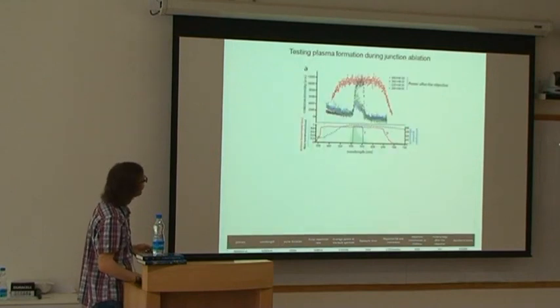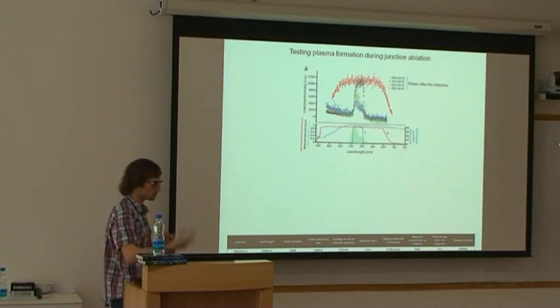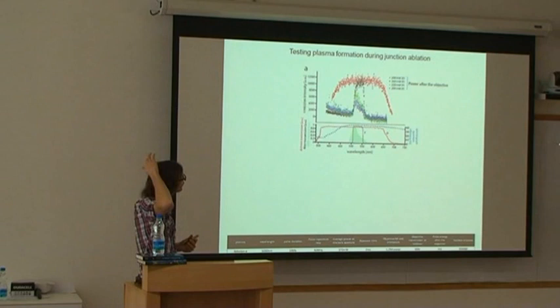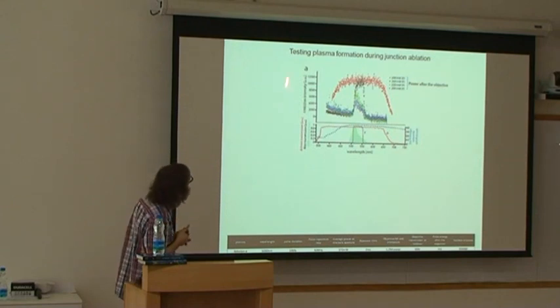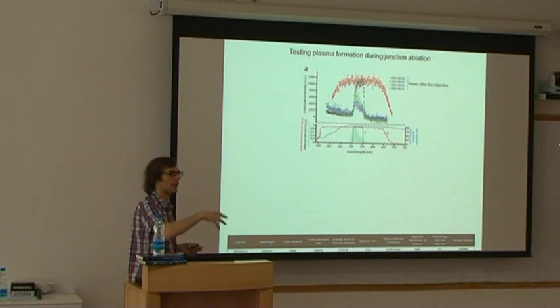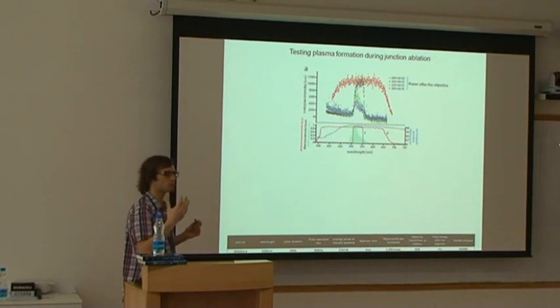Another type of analysis that I've done, so these are all experiments that I've been doing just really to characterize my tool. This is one that I liked a lot. I was very willing to do this, which was to try to couple a spectrograph within the microscope, and thus collect the light that I could probably produce by ablating.